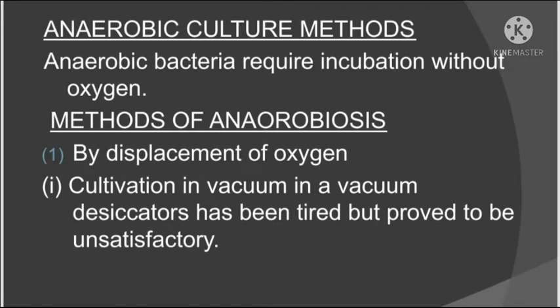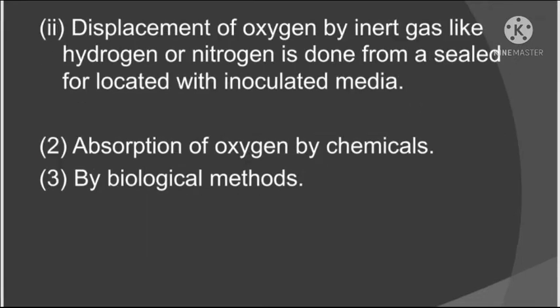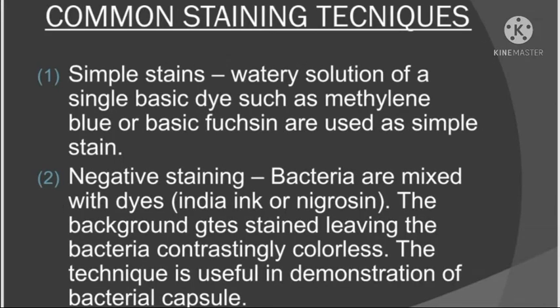Anaerobic culture methods. Anaerobic bacteria require incubation without oxygen. Methods of anaerobiosis: by displacement of oxygen, cultivation in vacuum, displacement of oxygen by inert gas like hydrogen or nitrogen, absorption of oxygen by chemicals, and by biological methods.